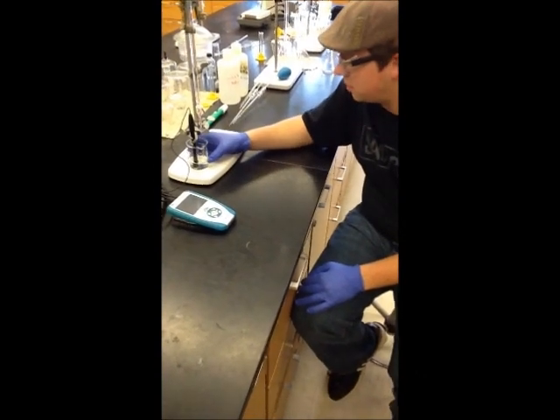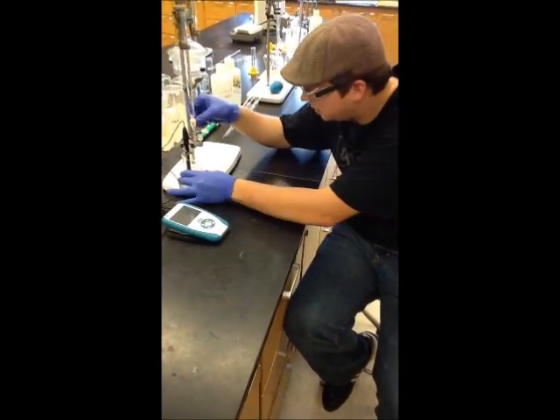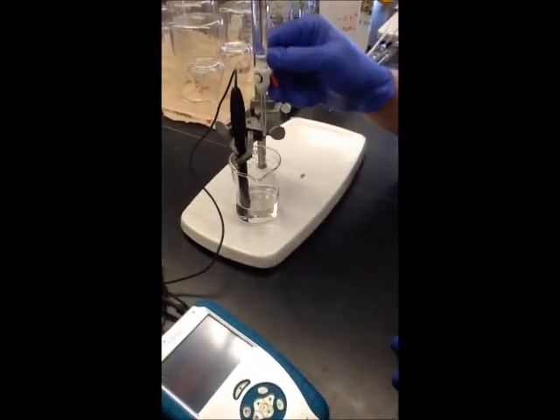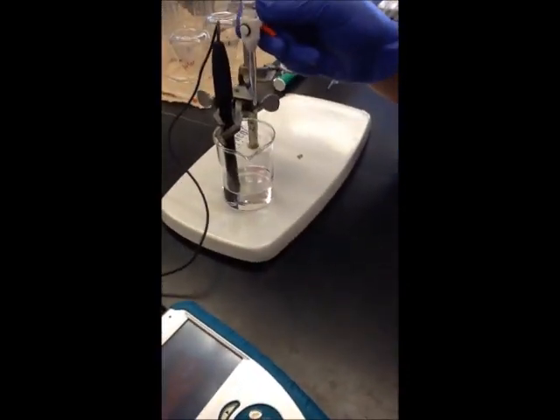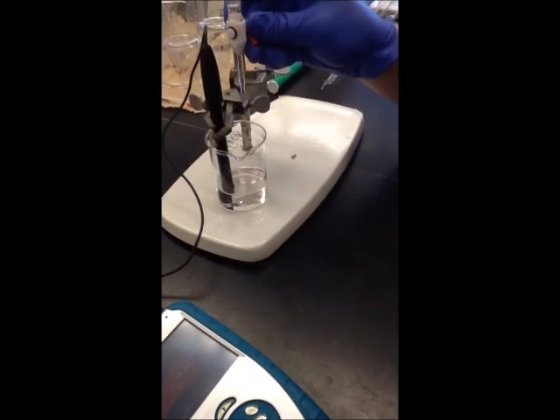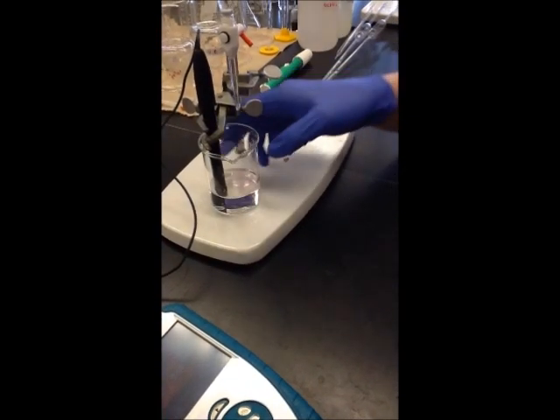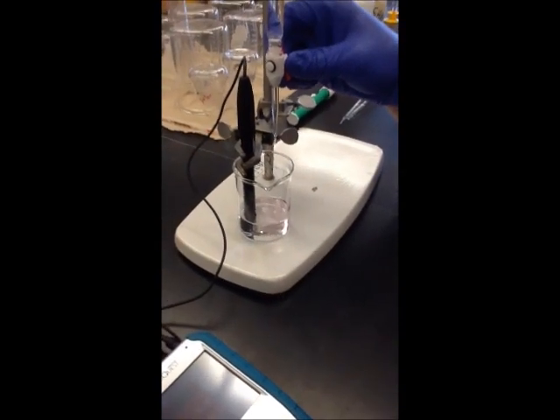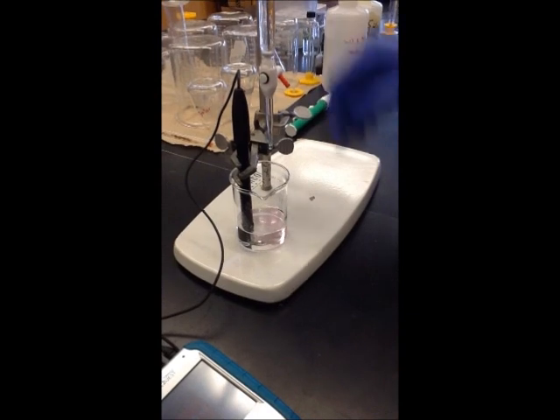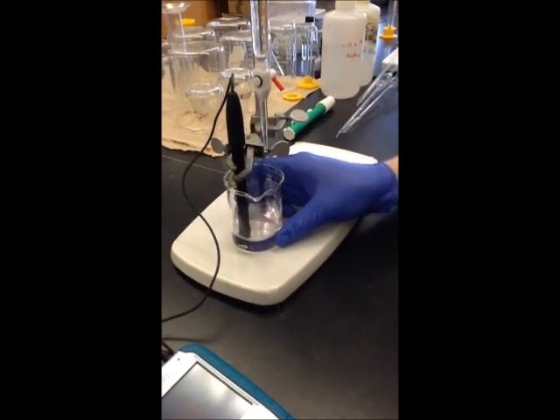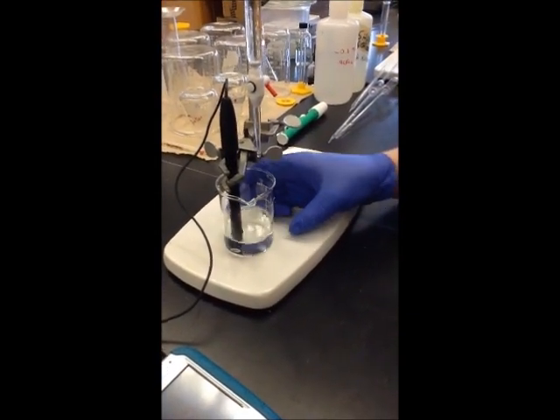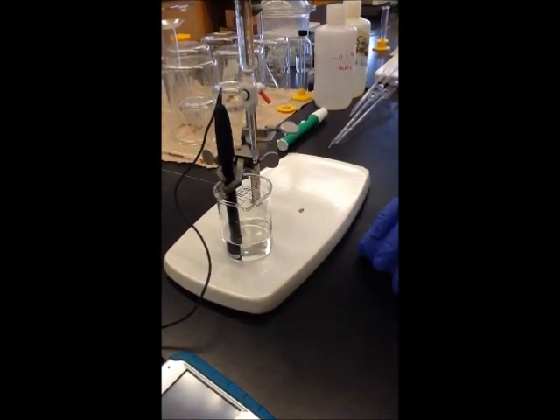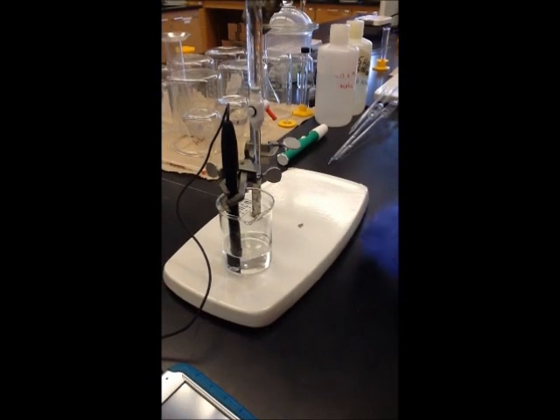As we approach the equivalence point, we're starting to see the purple color from the phenolphthalein indicator staying a little bit longer than usual in our solution. The purple color is very faint. You might not be able to see it on the video, but I assure you it is there. And we're actually having to stir the solution for it to go away, which means that we're getting closer and closer to our endpoint and our solution is becoming a lot less acidic.